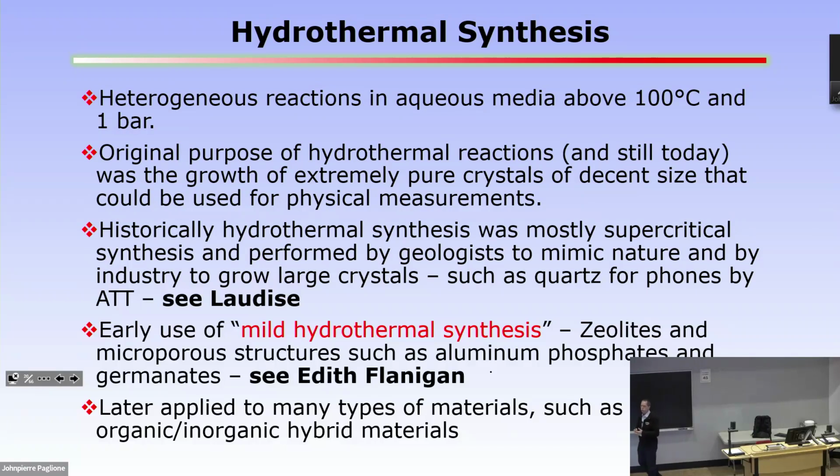Okay. Hydrothermal reactions, you should think of them as somewhat of a heterogeneous reaction environment. Not everything is going to be in the solution all at the same time. You can have something still in the solid phase. There's a kinetic aspect to it. Not everything dissolves equally quickly. Something's going to be in the solution, something's still going to be sitting on the bottom. So things to think about.